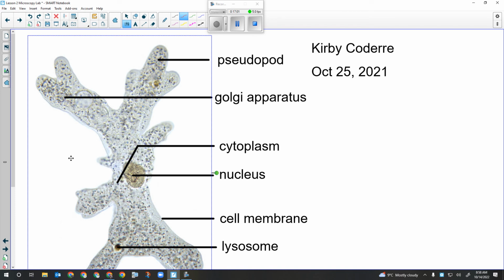Sometimes you're going to have this situation here, okay, where two structures are too close to each other for you to make horizontal lines for both. So you go up diagonally or down diagonally for one, and then over horizontally. Okay, it's again just neat. That way all the labels end up on the same side. All right, everybody good with that?